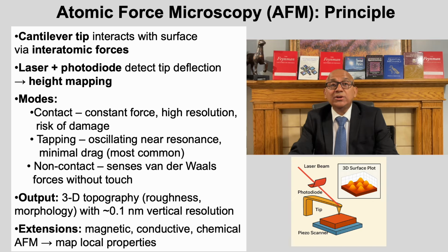In non-contact mode, the tip never touches the surface. Instead, it detects attractive van der Waals forces through shifts in oscillation frequency, enabling non-destructive imaging even in air. The resulting images can resolve atomic steps, grain morphology, and roughness with a vertical precision of about 0.1 nanometer. Moreover, by analyzing force distance curves, AFM can measure mechanical properties such as adhesion, stiffness, and elastic modulus.